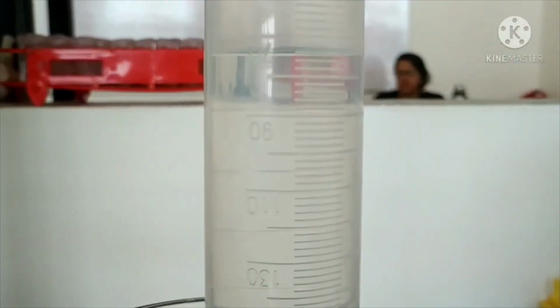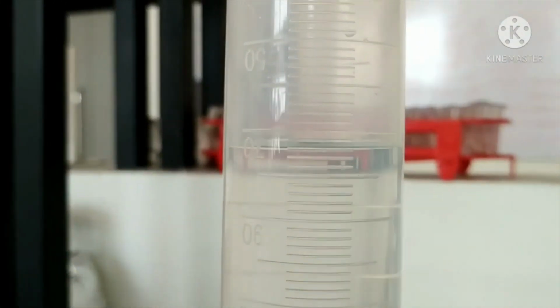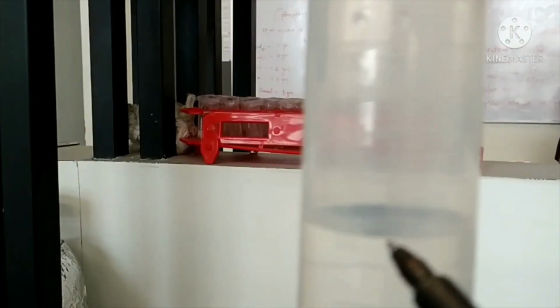Then we will see the marking, and it is showing how much, so it is showing around the inverted one at this point. We will mark it here.